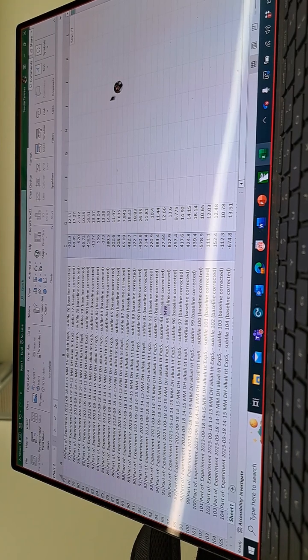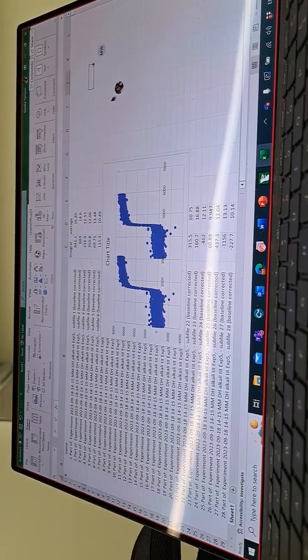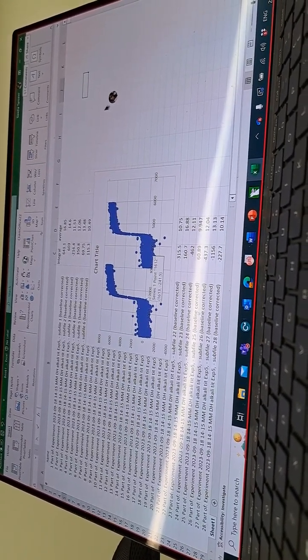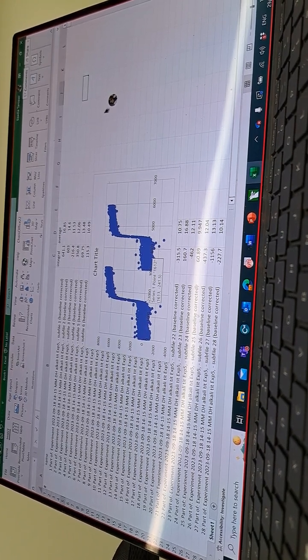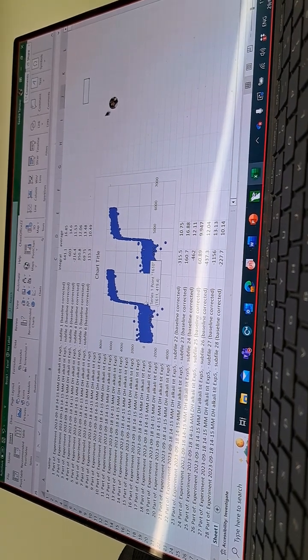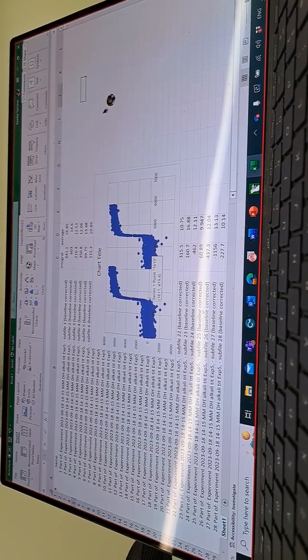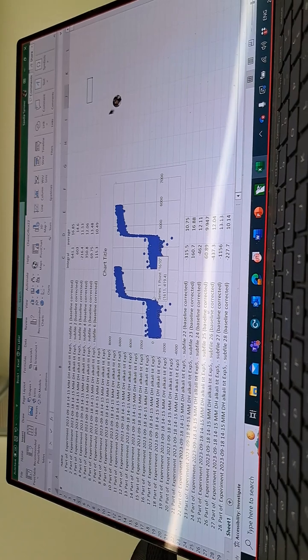Essentially, that's what you see. It's nothing, nothing, nothing. It's the 10.300. And then the area suddenly gets higher.